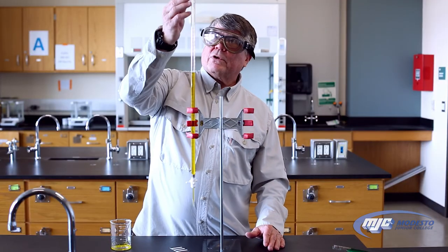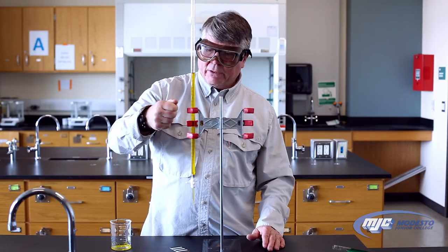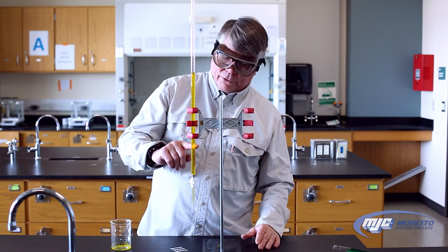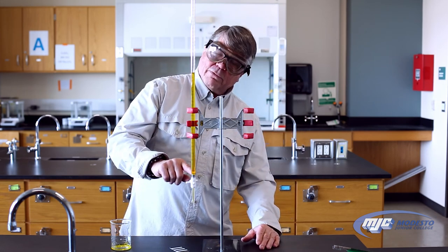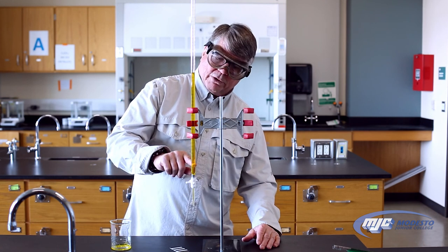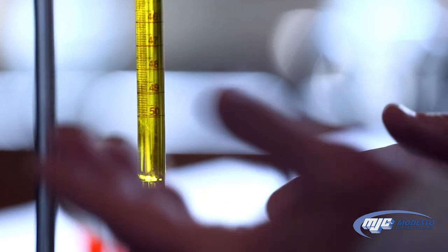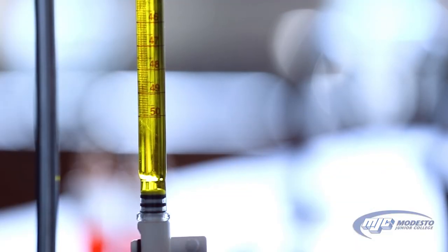Another thing to be aware of when you're using a burette is the bottom mark — it's not at the very bottom of the burette. You want to make sure you do not go past the very bottom mark. There aren't any marks past that, so you will have no idea how much you've added at that point.